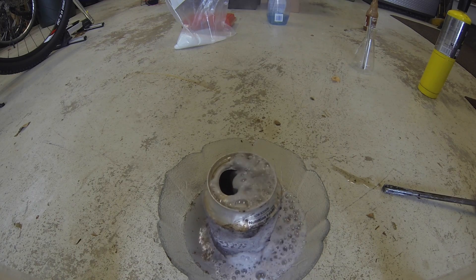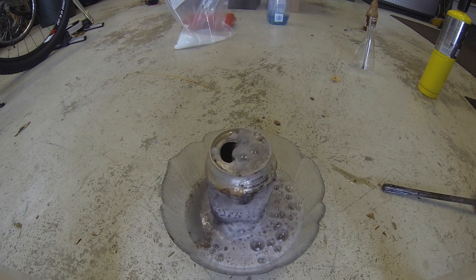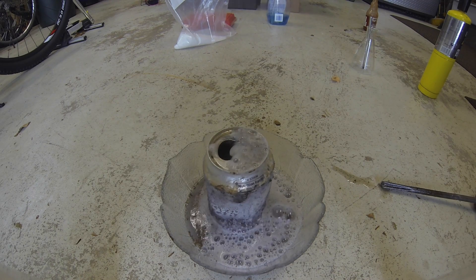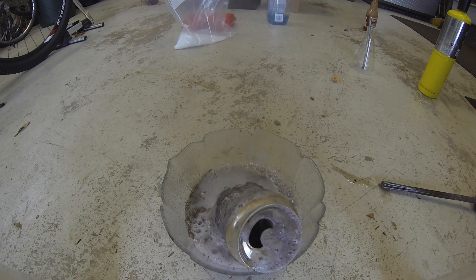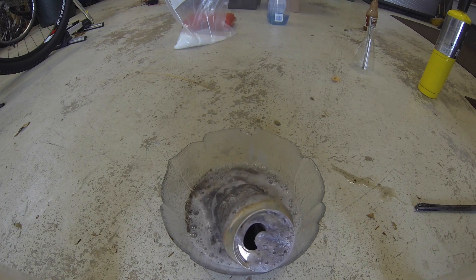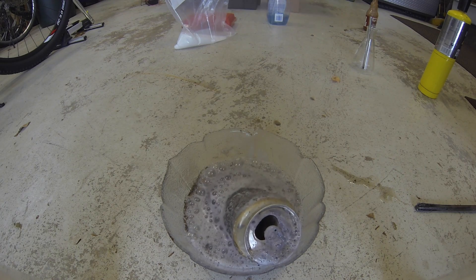On the bottom of the Coke can, you can start to see that there's a hole forming, and now it's much clearer. It just shows how quickly this solution — actually this is a base, not even an acid — is dissolving this metal, and it's dissolving as quickly as it moves down, which is incredible.